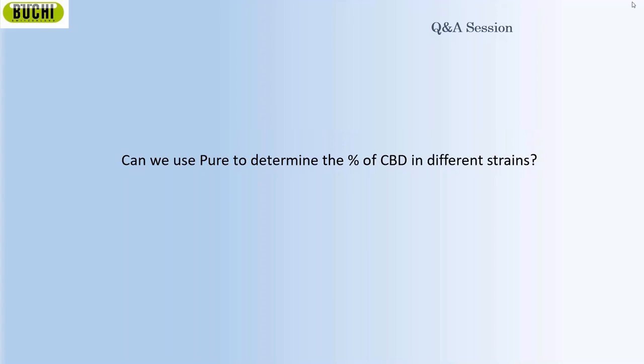Of course, no. Because the answer is, pure doesn't determine the amount of the CBD in your oil. What pure does is separate the CBD and THC from it. However, if you want to determine the amount of CBD in your strain, you have to go for the ProxiMate, like we answered on the first question.